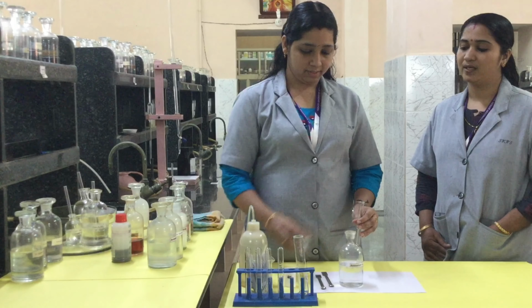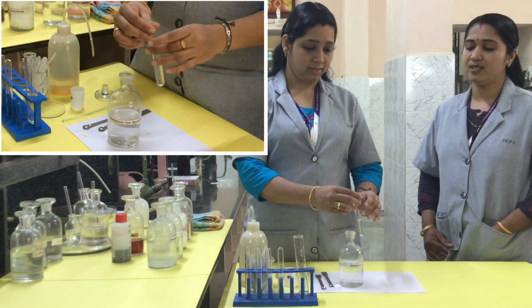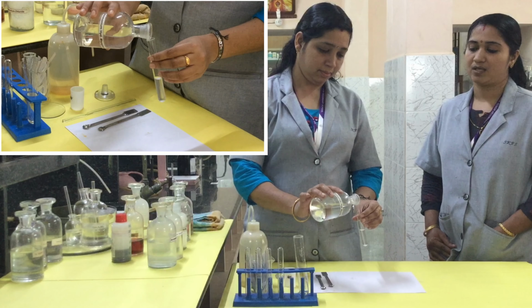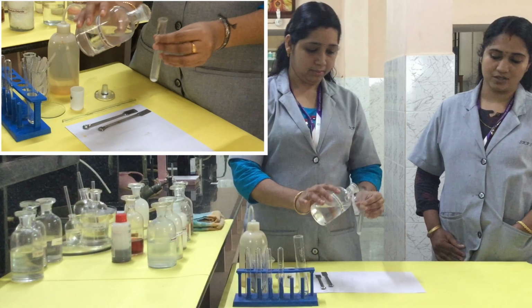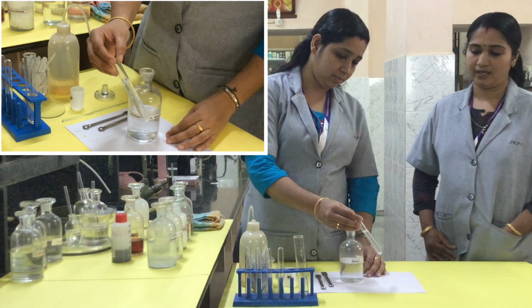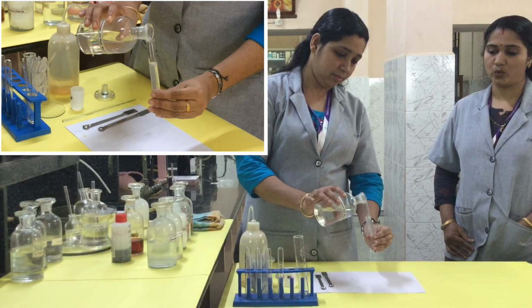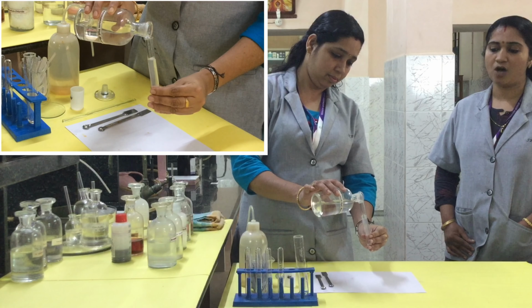The group reagents for the analysis of group 6 are ammonium chloride, ammonium hydroxide and ammonium hydrogen phosphate. We already added ammonium chloride and ammonium hydroxide. Now we want to add ammonium hydrogen phosphate. Just observe the change. You can see a white residue is formed. That indicates the presence of group 6.